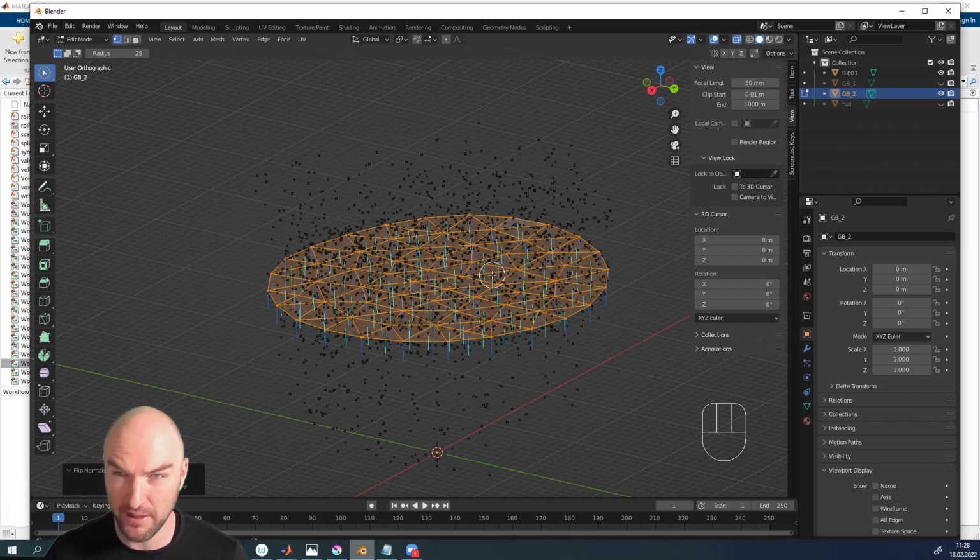And the definition, by the way, in the original paper about the isosurfaces, a very, very famous paper, the Lorensen and Cline paper, the surface normals point into the direction of higher value, I believe, or lower value, one of the two. Doesn't matter for us. It just needs to be consistent. And sometimes, you might want to flip the normals of your isosurface for some reason, because what is inside and outside might be a different definition that you have, and then you can go into Blender and do that. But that's a very important thing for us.